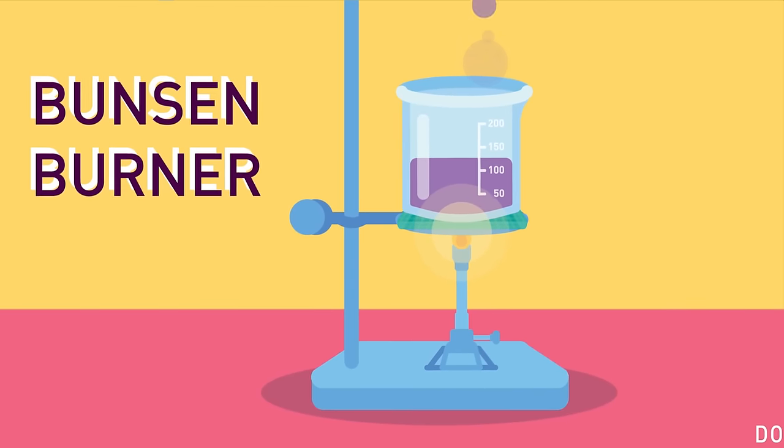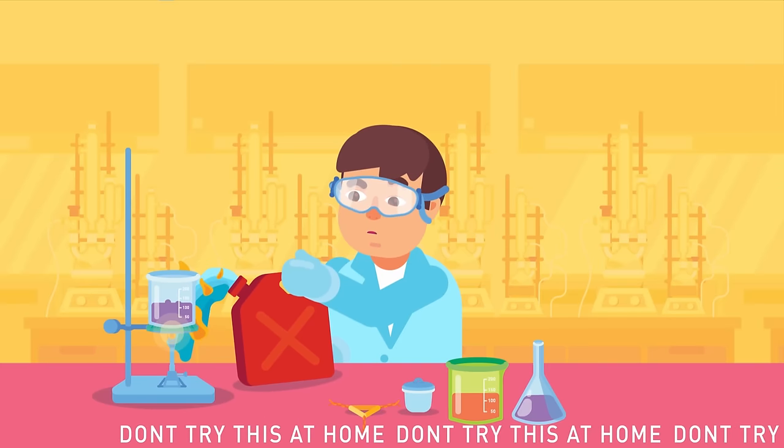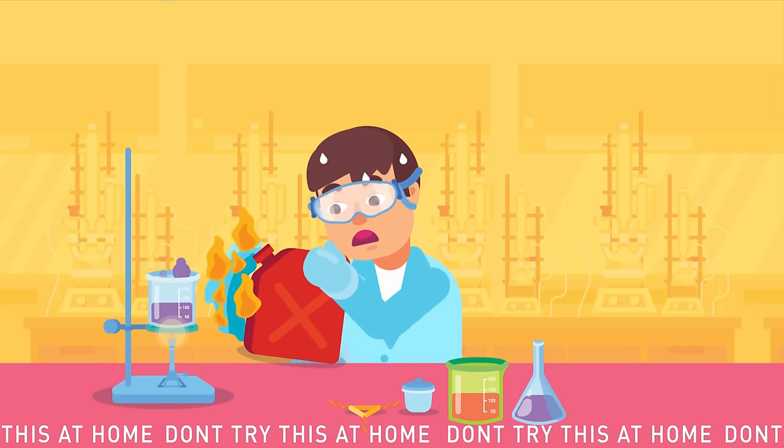Bunsen Burner. Be careful not to put flammable materials like a cloth or chemicals, like aromatic compounds such as petrol, anywhere near it, or this may erupt a fire.